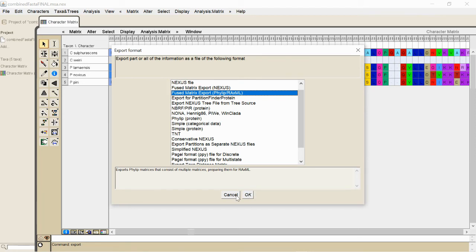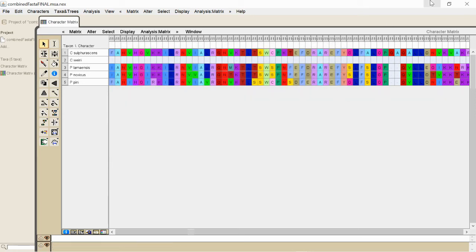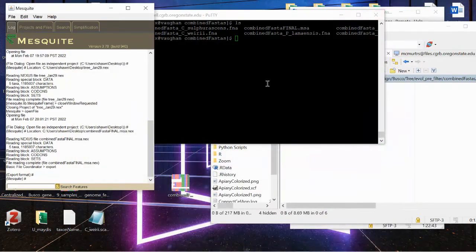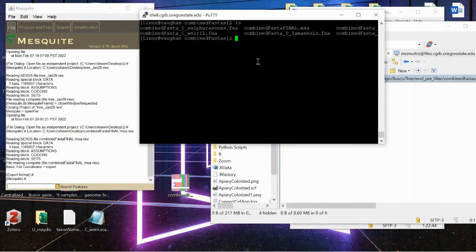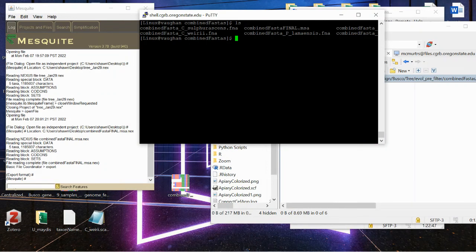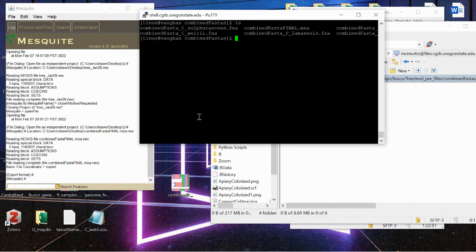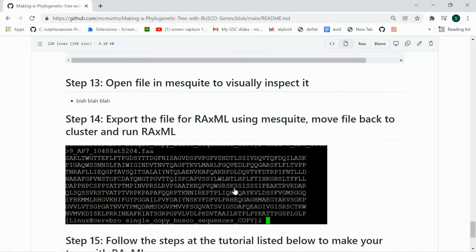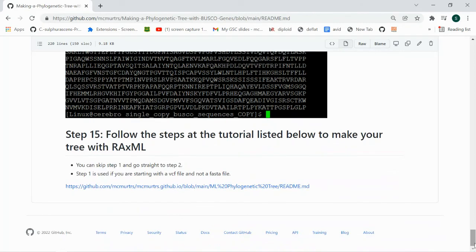And you'll go ahead and export it, and then you'll move it back to the cluster, and then that will put you in a good position for you to go on to the next tutorial on creating a RaxML tree, which is also linked here in the tutorial at the very bottom.